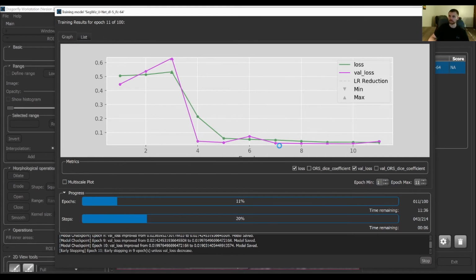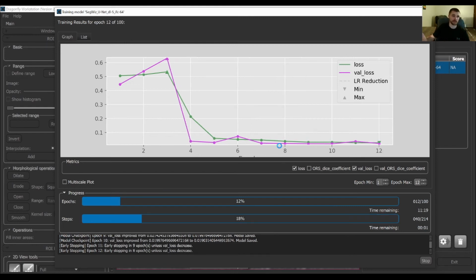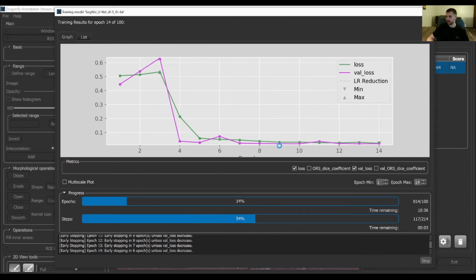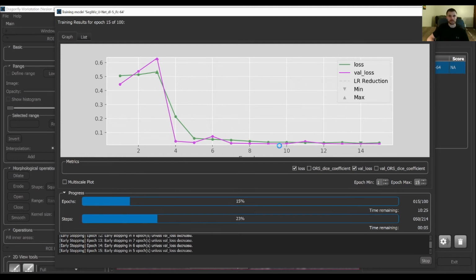And that's useful. That can be really useful if you're wanting a really quick model. Oftentimes, if I'm wanting a robust model, I just let it run for 100 epochs straight. That's up to you. You do not have to do that. Usually 10 gets you pretty much as good as it gets. So we're going to go ahead and wait this out, and once it's done training, we'll see what we get.